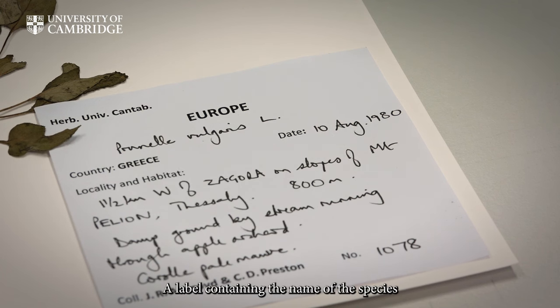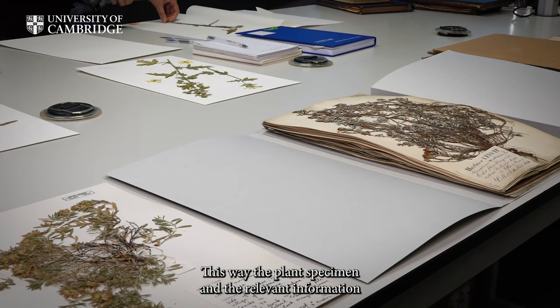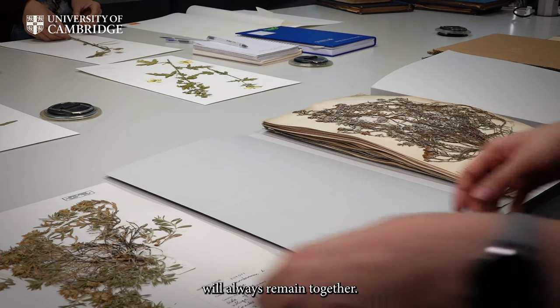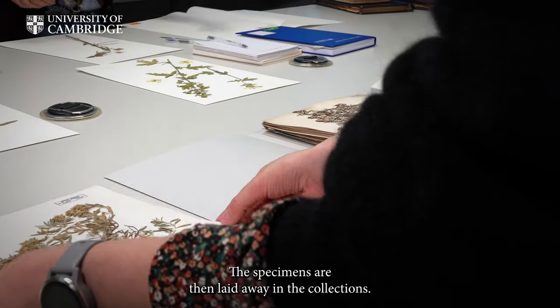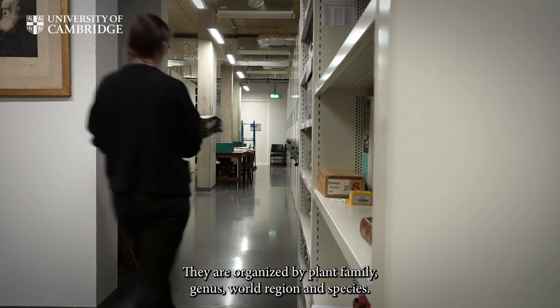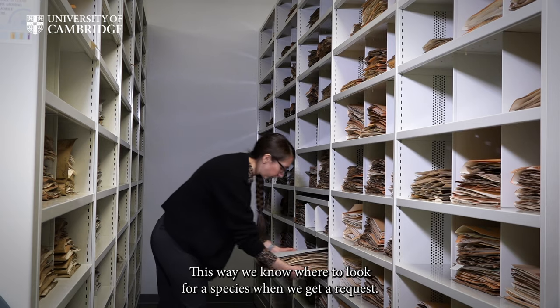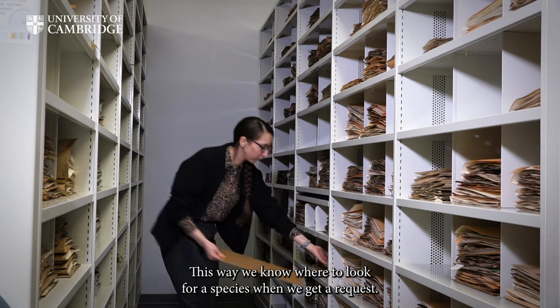A label containing the name of the species and all the collection information is glued to the sheet. This way, the plant specimen and the relevant information will always remain together. The specimens are then laid away in the collections. They are organised by plant family, genus, world region, and species. This way, we know where to look for a species when we get a request.